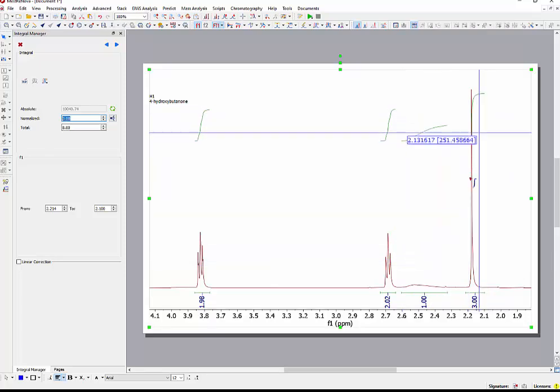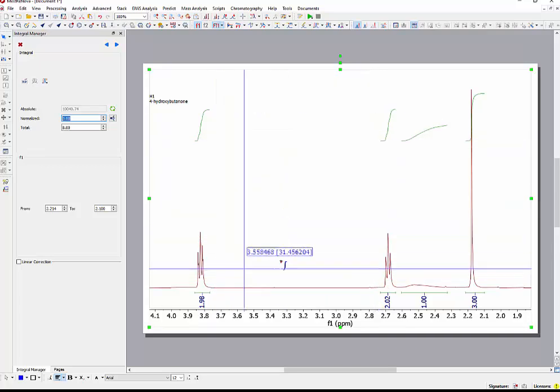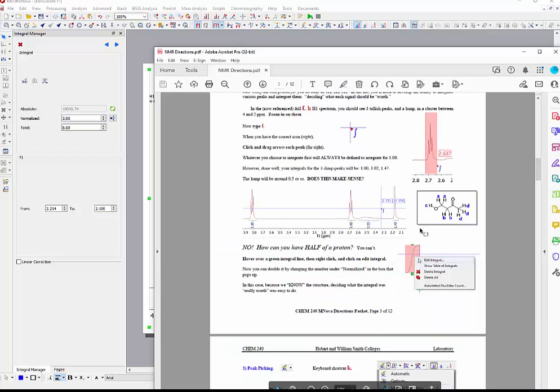This is now a methyl group. This now integrates for 1H, which makes sense. And then I have 2 triplets, which also integrate for approximately 2H each, which again makes sense in light of the structure that we know we have, where we have a methyl, an OH, and then 2 things that should be triplets that also have 2 H's in them.